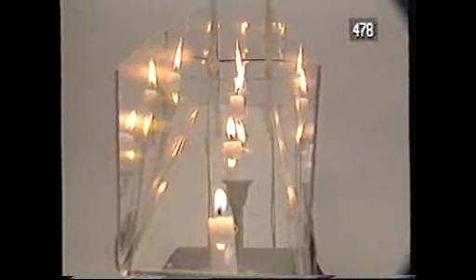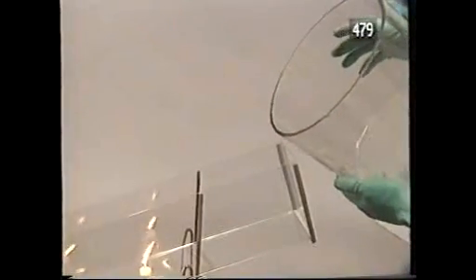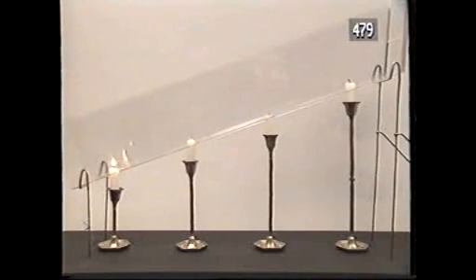These candles are burning in a sloping perspex gutter. I filled this tub with carbon dioxide. The dense and invisible carbon dioxide creeps slowly downwards along the bottom of the gutter, and as it goes, it snuffs out the candles one by one. So carbon and oxygen react to form a gas, carbon dioxide, which is very dense and puts fires out.